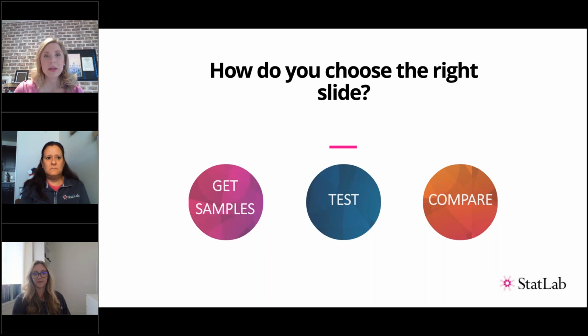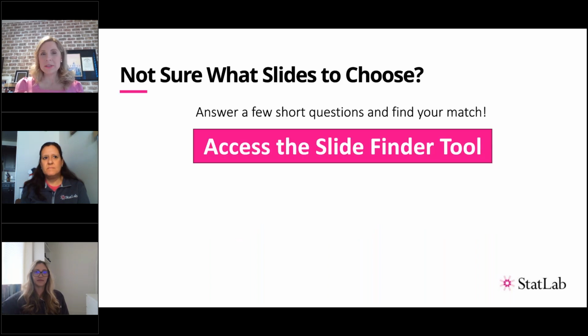See how they work, and then compare the results. Do a side by side, just like what we've shown earlier. Hold those slides, put them in the same protocols, see how they perform in the same environments, and see if you can see differences, or if you still need to take a look at something new. So with that, how do you get samples? How do you test? What are my options?